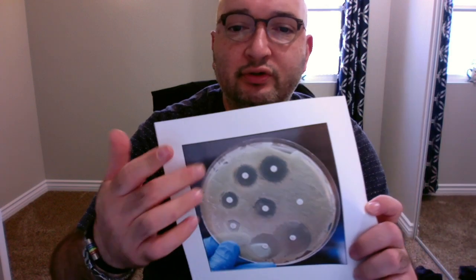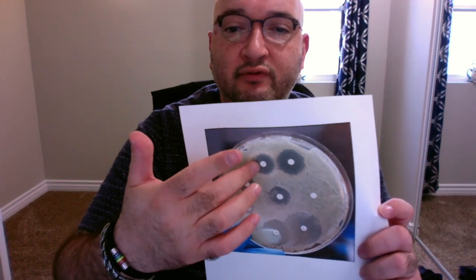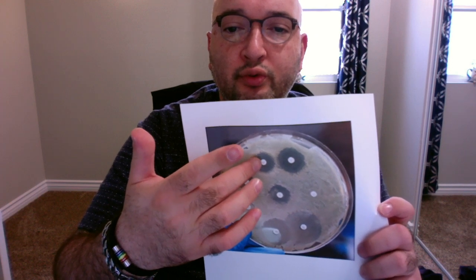Had I gotten this, what I would have done is measured in millimeters from this zone of diffusion, this clear part, to the antibiotic disc. Of course, the larger that distance, the more inhibition, or the stronger the antibiotic is, versus something that is smaller, the weaker the antibiotic is.